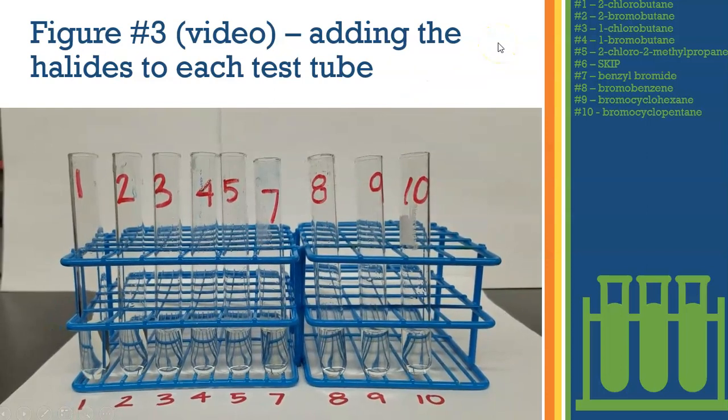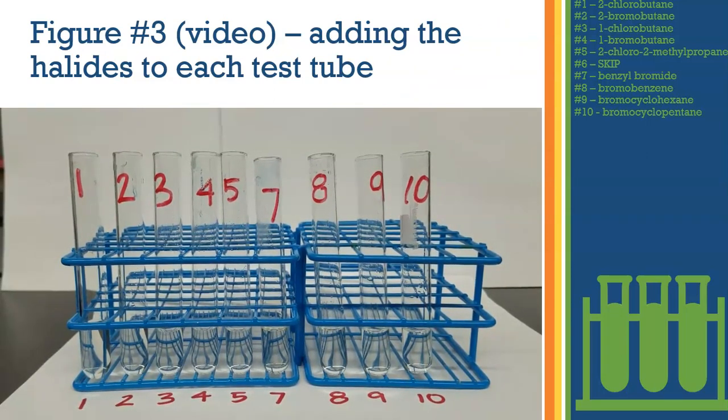This video is showing the addition of approximately 4 drops of each of the alkyl halides to their respective test tubes. It is also showing the immediate reaction of the alkyl halide with the sodium iodide.